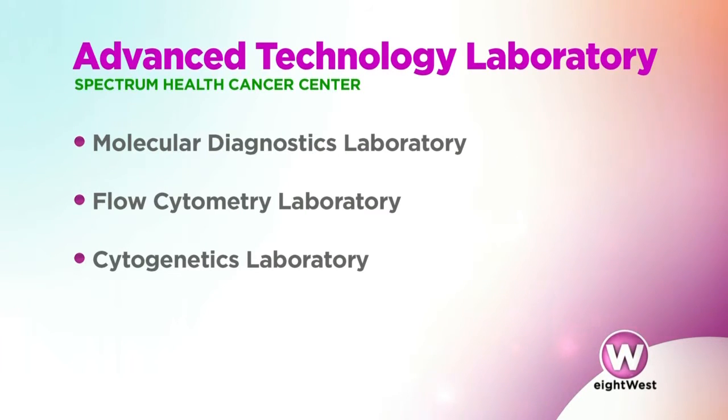That's so important. People want results. They want to know the answers to these tests as soon as possible. What is the difference between the three of these? The easiest way is to kind of describe the parts of the cell that they look at, because they really build on each other. Flow cytometry is the study of the proteins on the surface of the cell. So we're first looking at the outside of the cell, and that's where we diagnose leukemias and lymphomas. In cytogenetics, we go inside the cell and we pull out the chromosomes, and we're looking at a variety of methods to determine if there's anything wrong with the chromosomes. Then in molecular, we go into the chromosome and we pull out the DNA and RNA and do our testing on that.